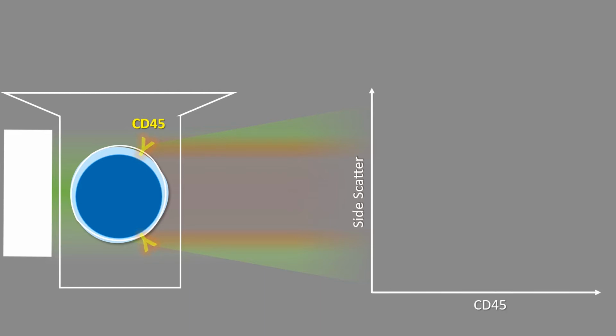In multiparameter flow cytometry, along with forward and side scatter, antibodies that are coupled with fluorochromes are added to the cells before passing them through the cytometer. Now, when the cells are illuminated, these antibodies coupled with fluorochromes emit a fluorescence at a specific wavelength and it is measured by the device. The measured fluorescence can now be plotted in a 2D scatter plot that is shown here.